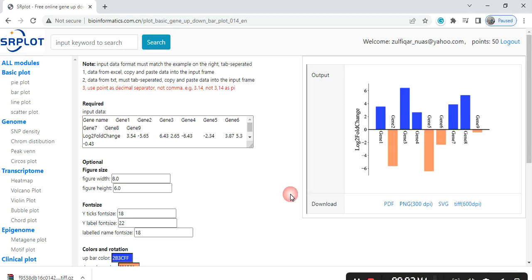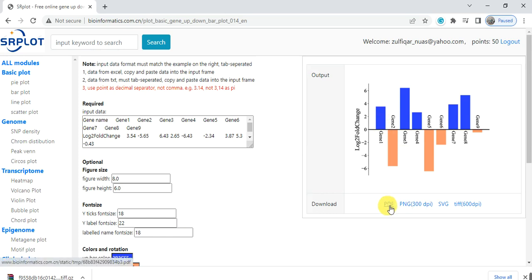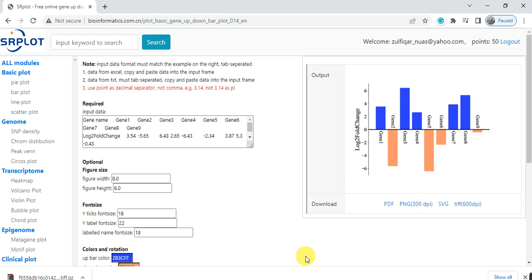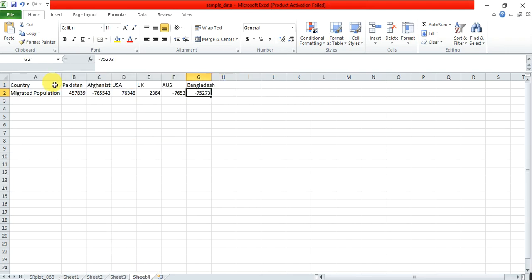So here you have got your graph that shows that the downward shows the negative values and the upward shows the positive values. And by clicking on PDF or TIF you can save it into your destination folder and then use this graph.